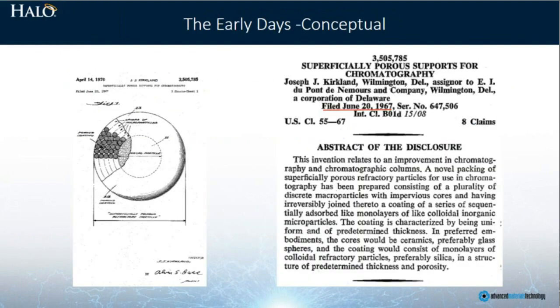The superficially porous particle technology is not a new concept. It's been around since the late 60s. This is the first page and first diagram from a patent application that, as you can see, dates from the late 60s.